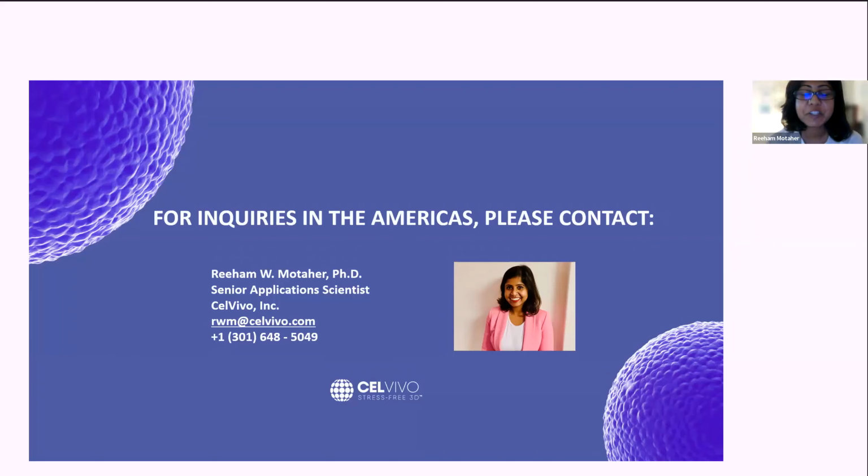Thank you. Another question: can you share some experimental and CFD simulation of shear force calculations in the clinoreactor? Yes, we have a publication from a long time ago, and right now we don't have the newest data. We are actually working on some simulations, so we can share some numerical data. That's what is in our publications, I think from 2018, where we did the calculations, and right now.